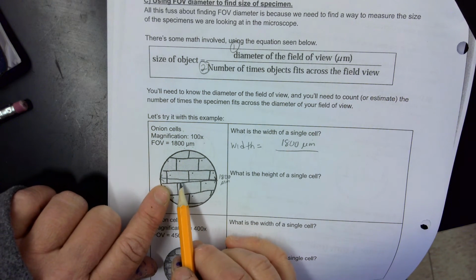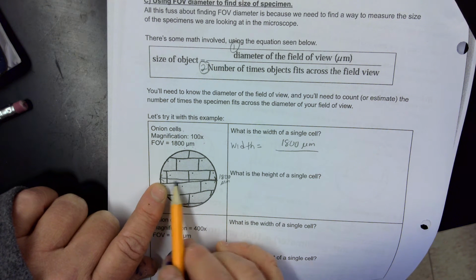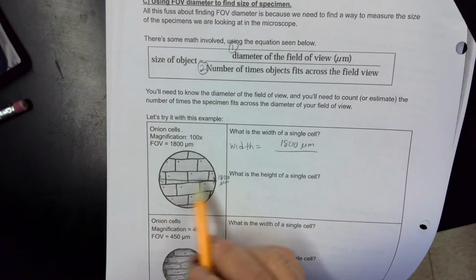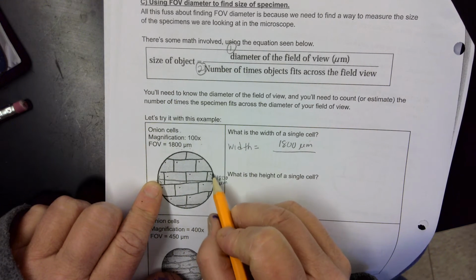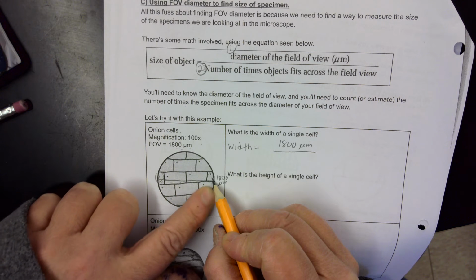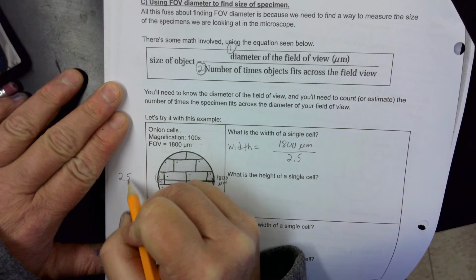We've got some cells here, and we try to find the cells across the diameter. I've got two full cells, right? Two full cells, plus these other cells which are kind of fitting across. So let's say that this cell plus this cell, if you patch those together, we maybe have about a half a cell. So we can fit about 2.5 cells across.